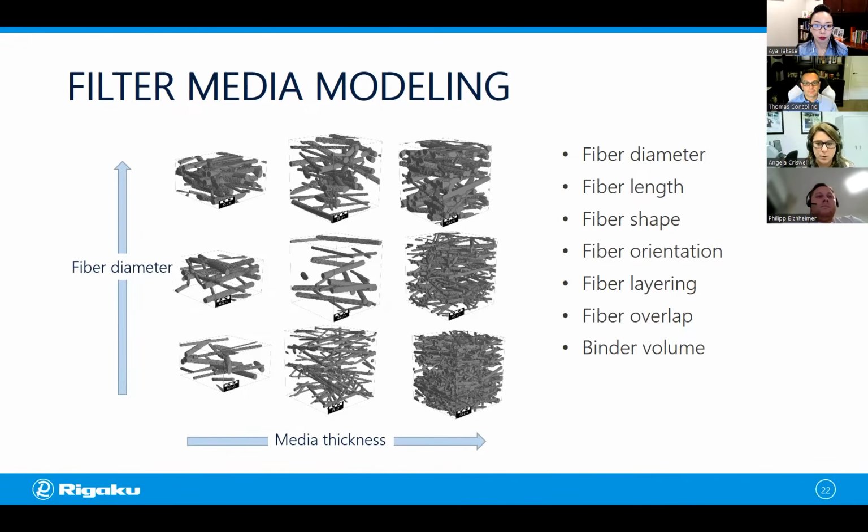Eventually you'd pick the subset that has the characteristics you want, manufacture them, and test them, and hopefully the goal here is to make the process faster and less expensive. So that's why we're doing all of this. All right, so let's get ready for some hands-on with GeoDict.